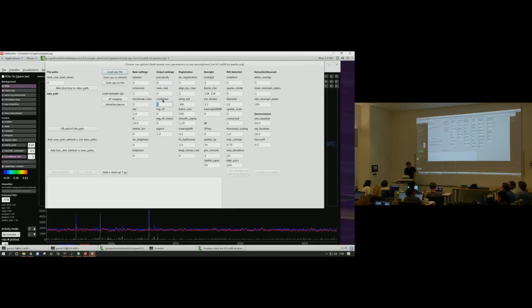Combined is whether you want to create a combined view, where if you have multiple planes or a mesoscope bigger field of view that you want to tile together, you can do that. Actually, I'll show you an example of loading a mesoscope field of view in the GUI.